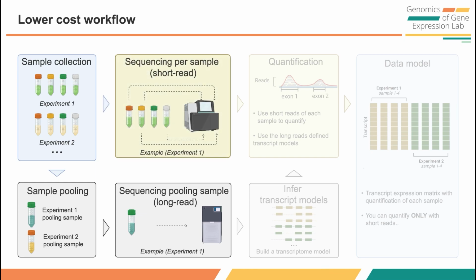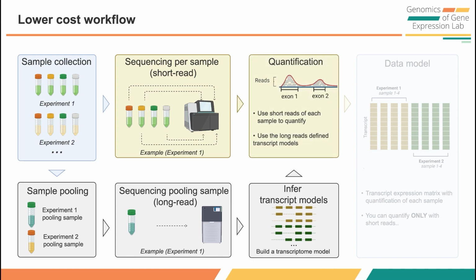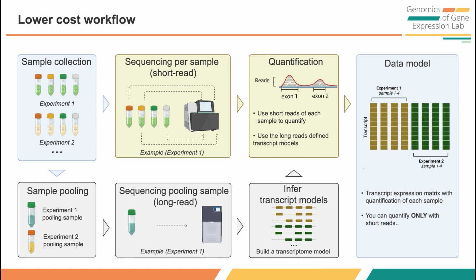The transcriptome model is built based on the long reads pooled sample data. Finally, you can get a transcript expression matrix with quantification of each sample. However, in this workflow, you can only quantify the long-read defined transcriptome using short-reads data.